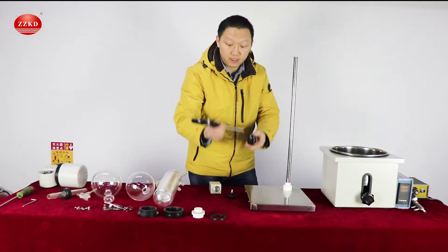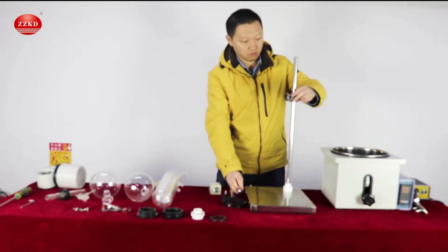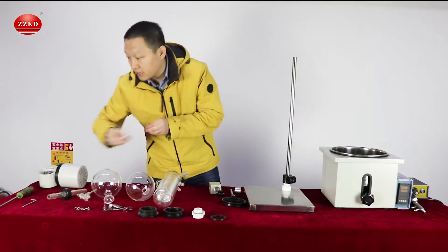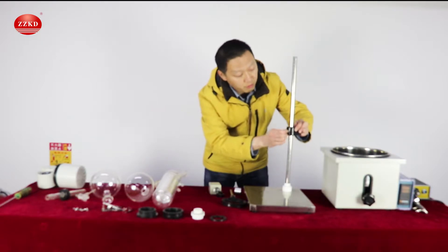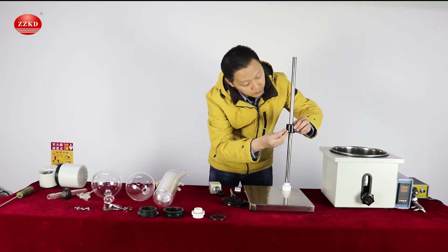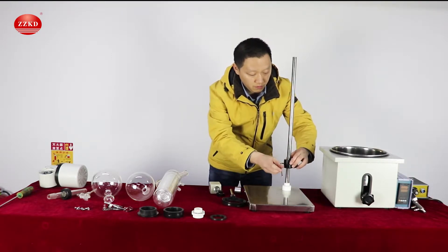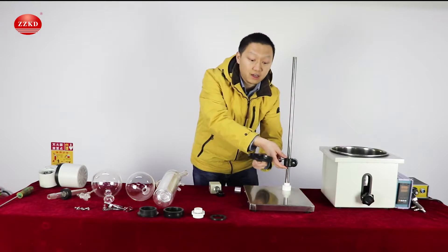Now we will put the stand — this is the stand for the receiving bottle. It can rotate like this. We need one flat head bolt and this allen wrench. There's one hole here. We put this flat head bolt inside and use this wrench to fasten it. At first, don't fasten it too much, because later we need to adjust the height of this support.